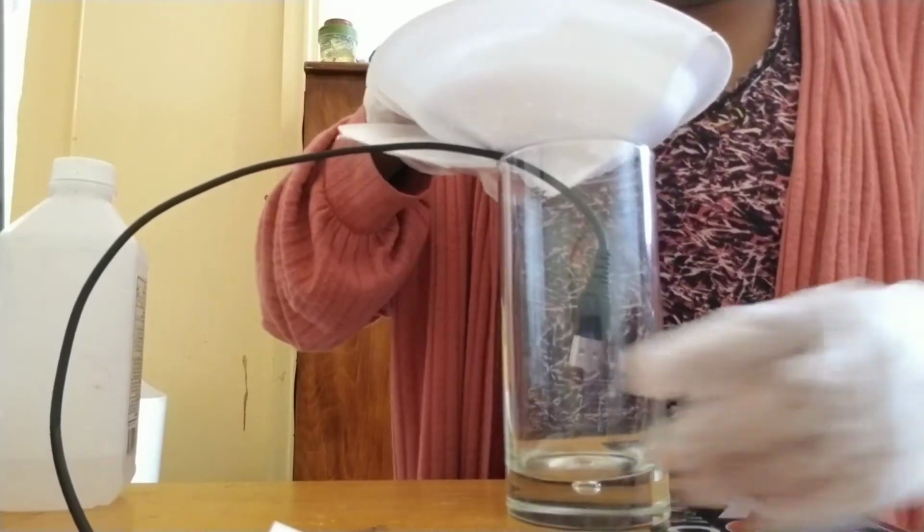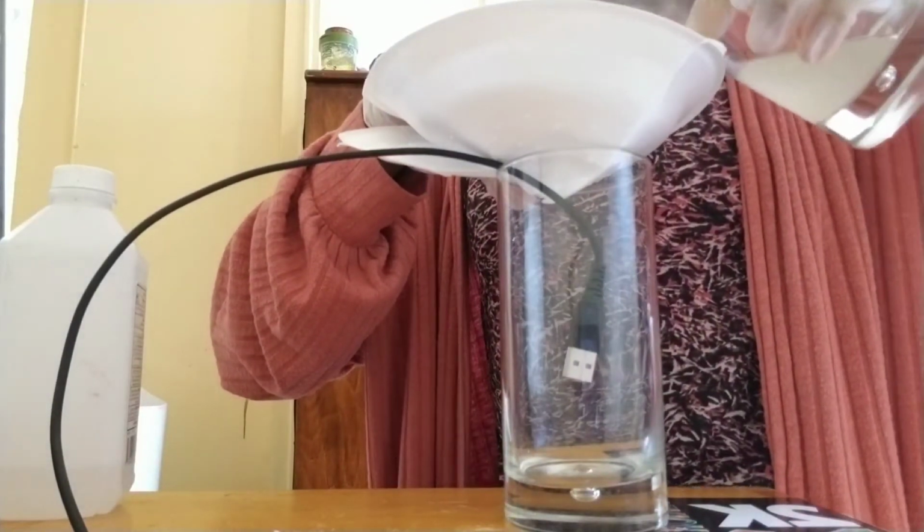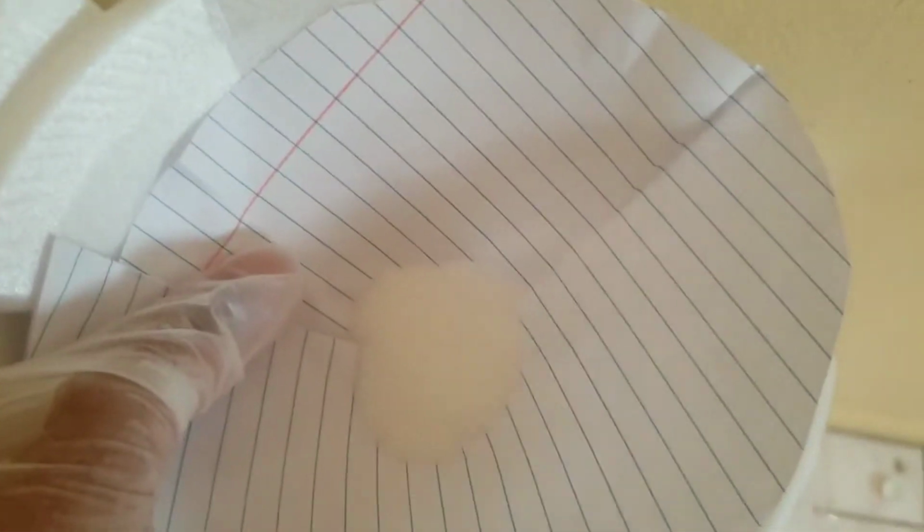And then we're going to take our alum crystals from our ice bath, and gently pour it in. After doing so, we're going to let it dry. After drying, this is what it looks like. And then we're going to take the mass of the filter paper and the alum crystals on top.